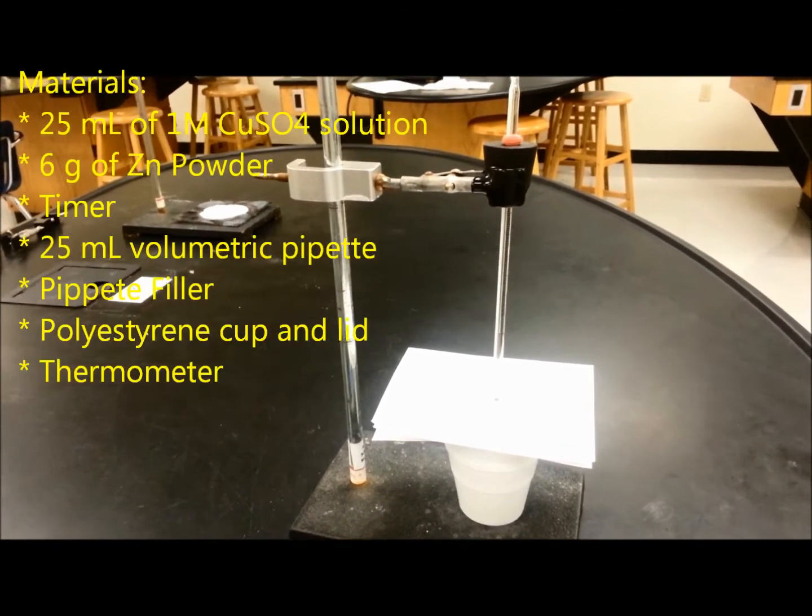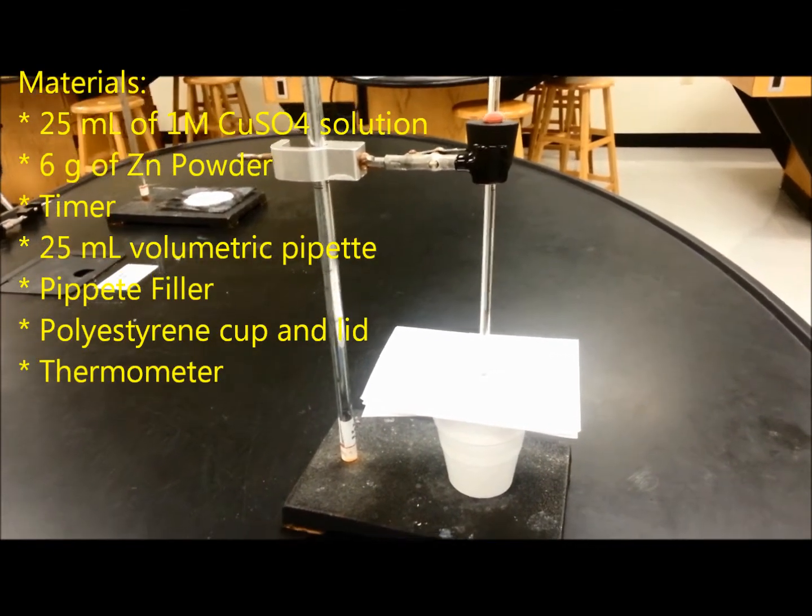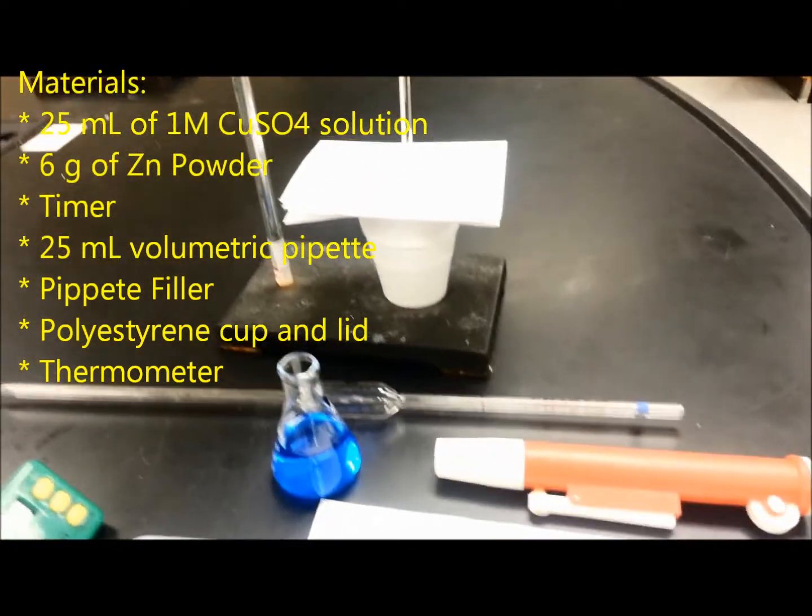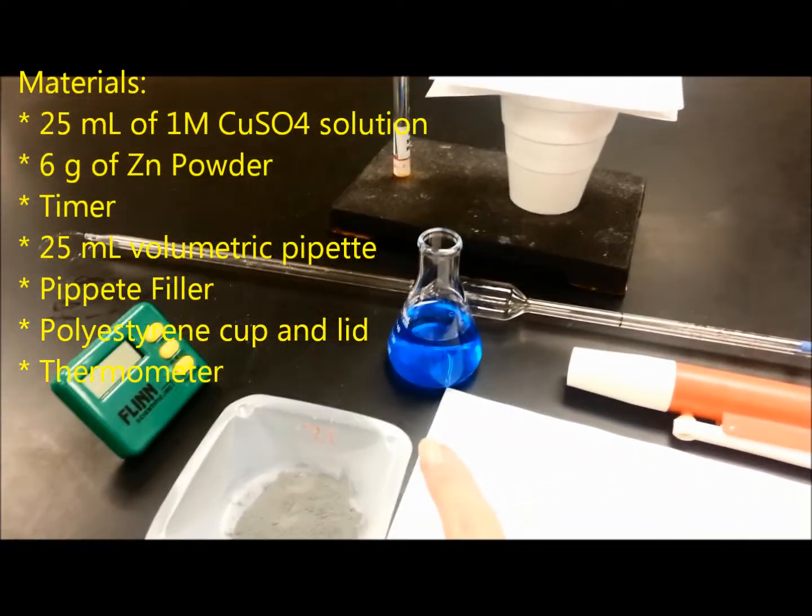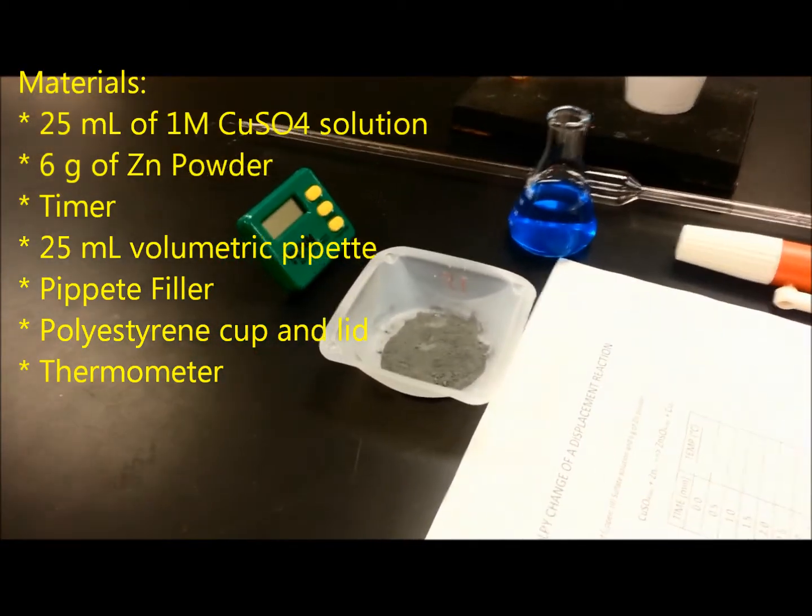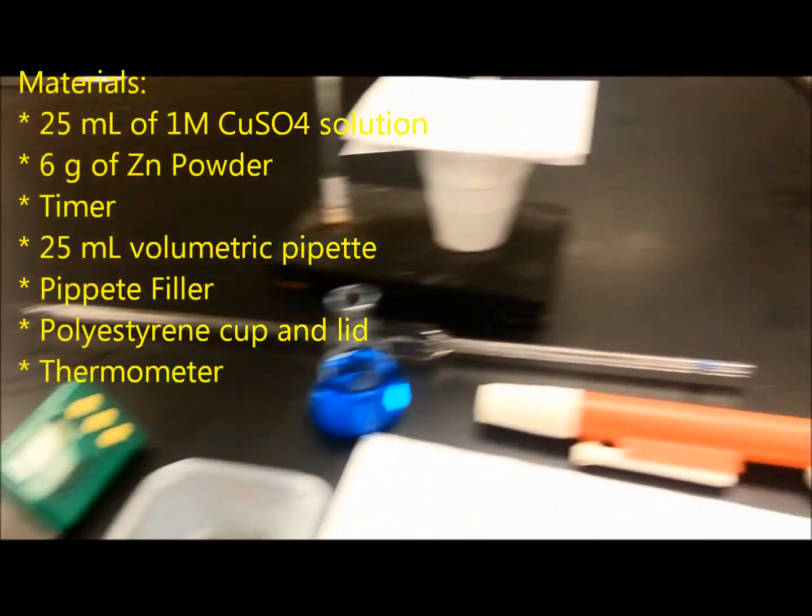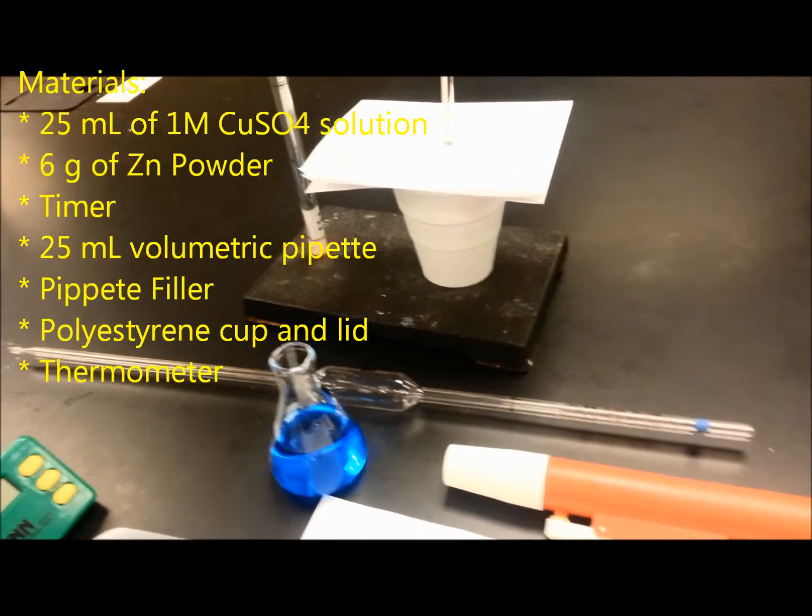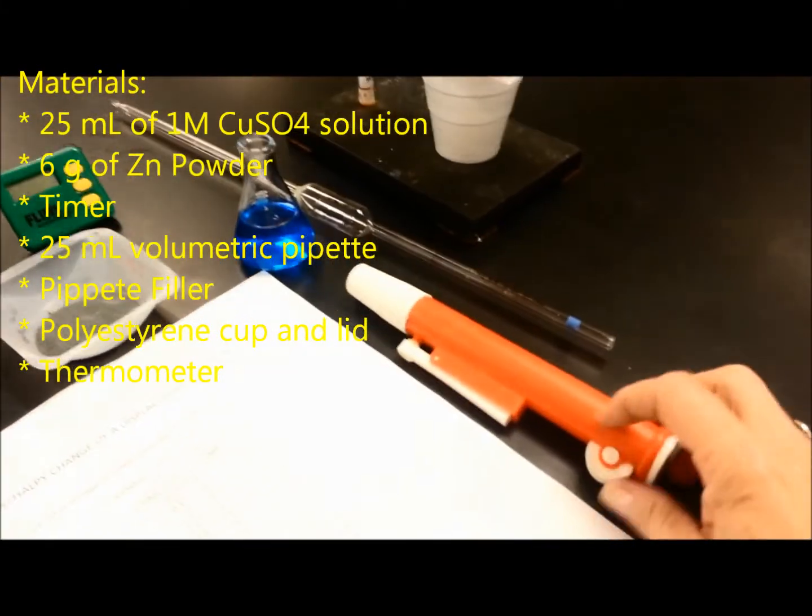Enthalpy change of a displacement reaction. For this lab, we're going to need 25 milliliters of copper sulfate solution and zinc powder, a timer, a pipette, 25 milliliters, and a pipette filler.